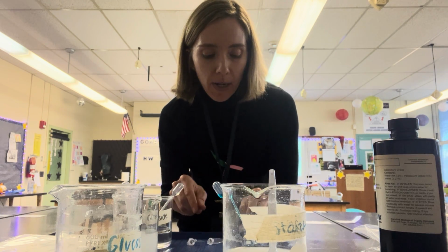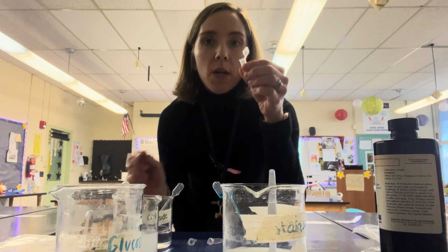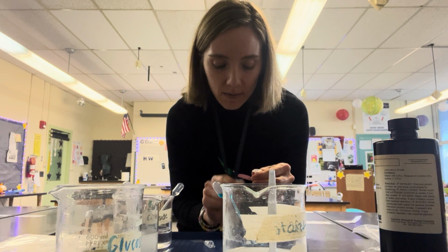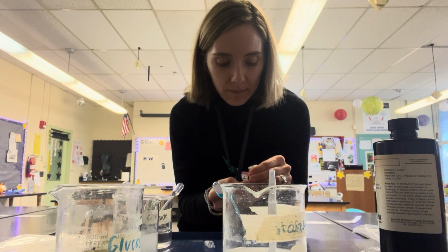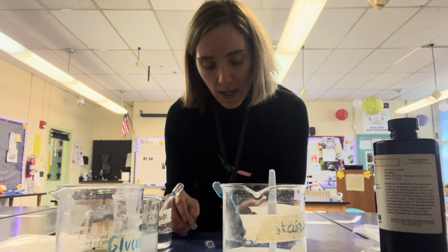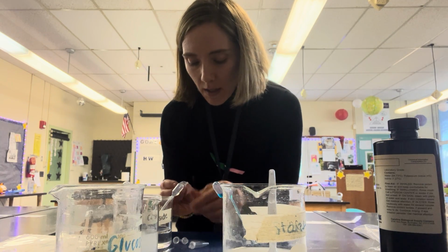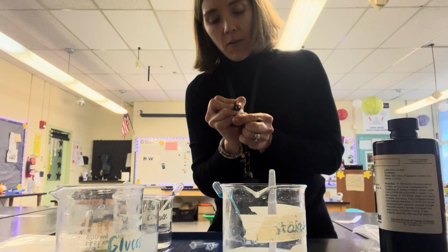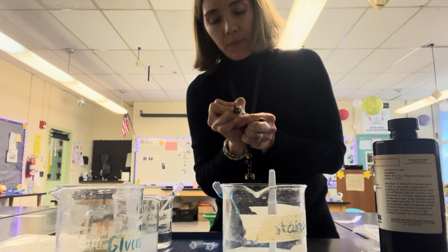So looking at my tubes, my first one I'm going to do is the outside Benedict's. So I have outside Benedict's, I have inside Benedict's, and this is going to be outside iodine.